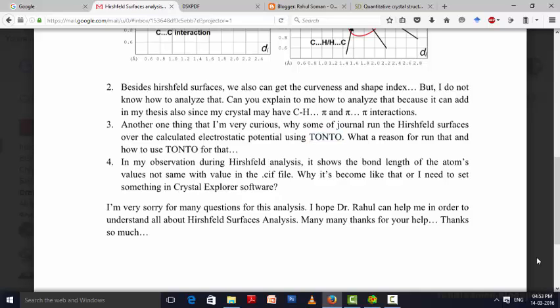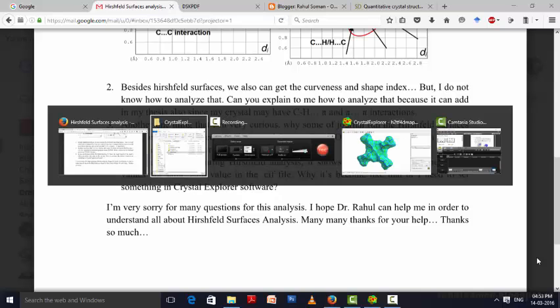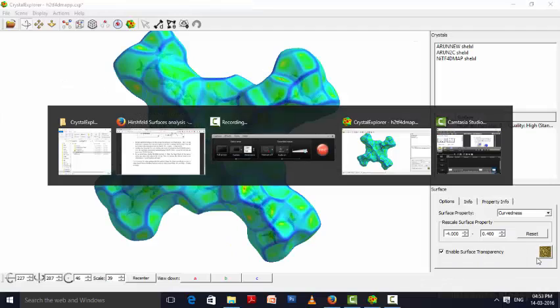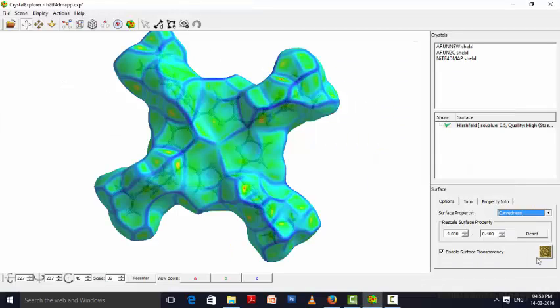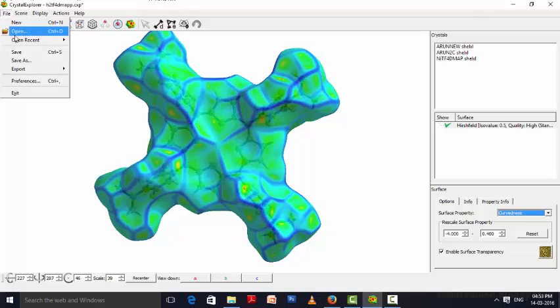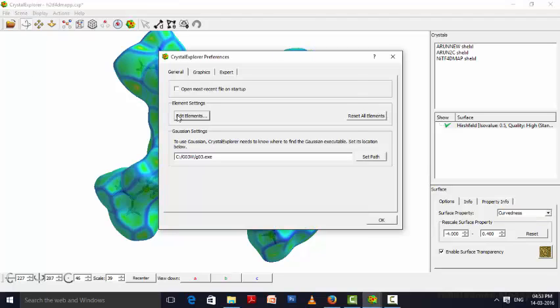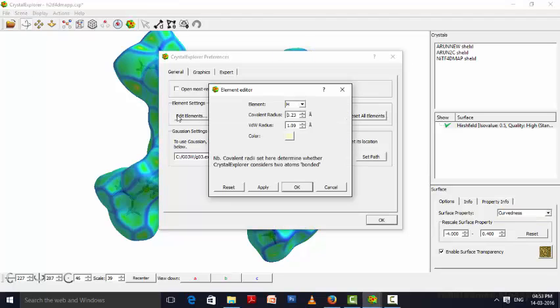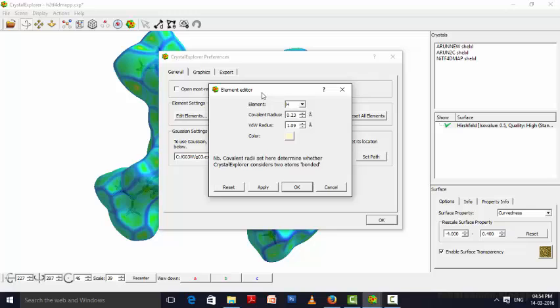Let's come to your last question. In my observation during Hirschfeld surface analysis, it shows the bond length of atoms values are not same with the value of CIF file. I guess it may be because in Crystal Explorer you can manually edit the atomic radii of an atom and van der Waals radii of an atom. In your Crystal Explorer you can make sure that your atoms are having proper atomic radii and van der Waals radii. For taking how to edit that, you can come to the preferences and take the element editor, and you can change that by one by one.